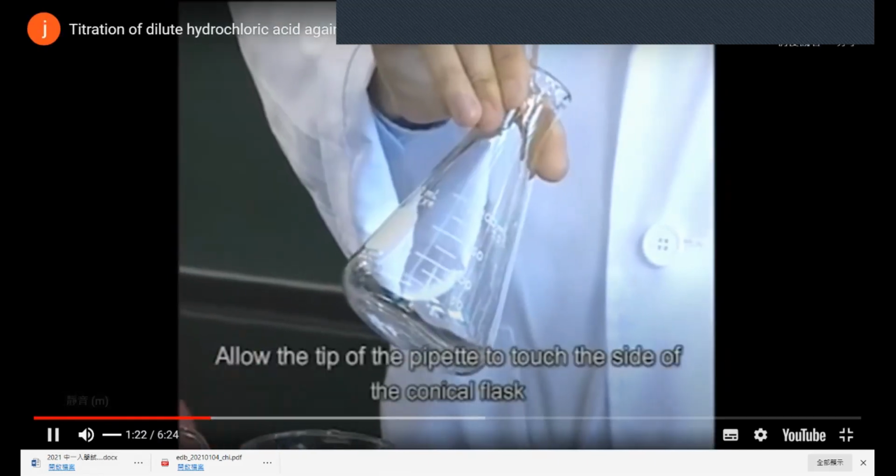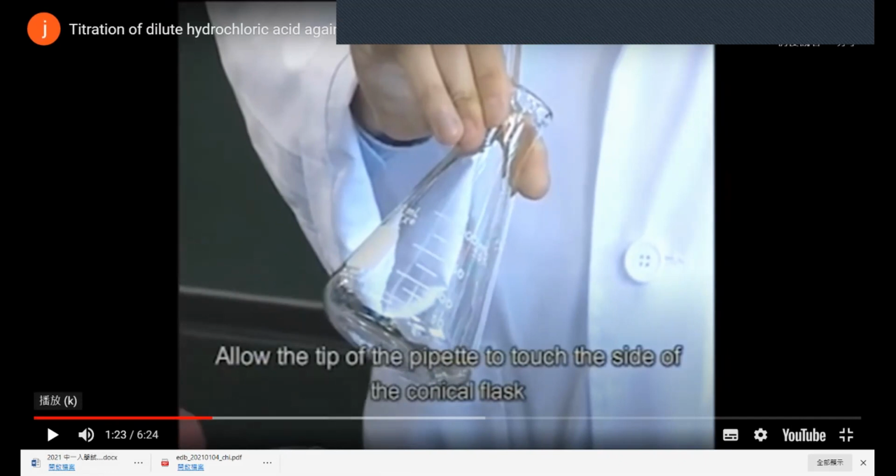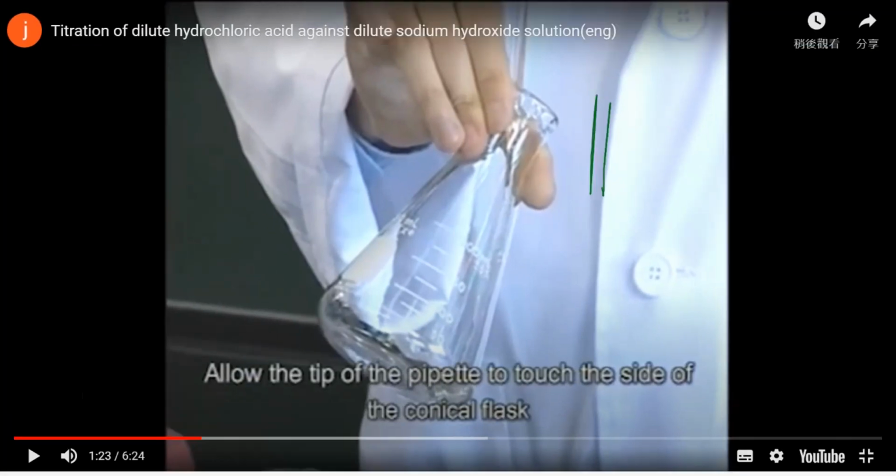Allow the tip to touch. When the solution reaches the end, a little water remains at the tip of the pipette because of surface tension. So never blow out the last drop. Instead, allow the tip of the pipette to touch the side of the conical flask.